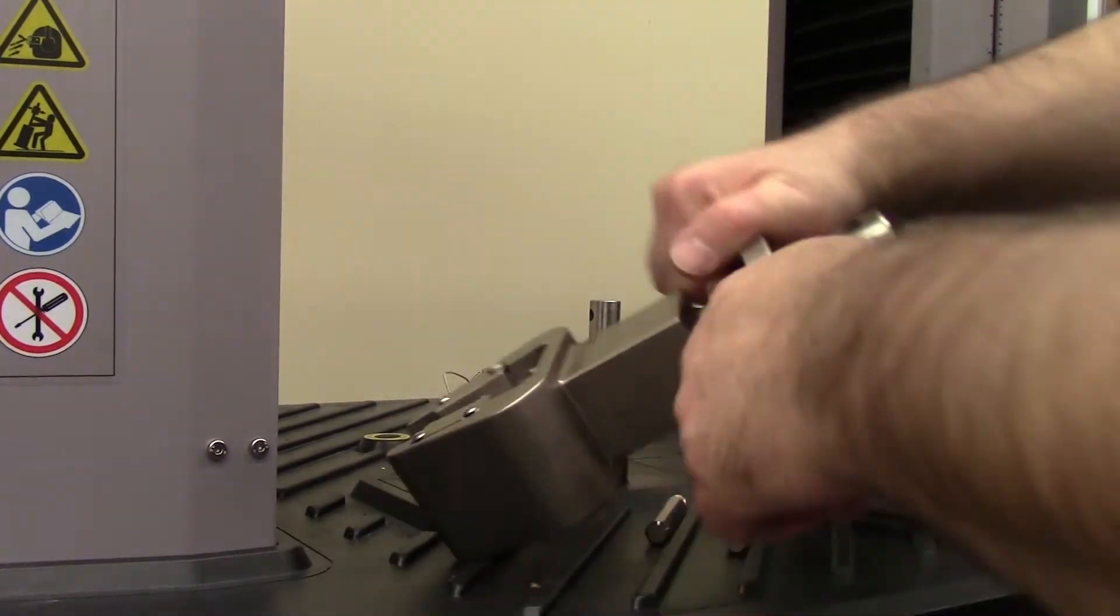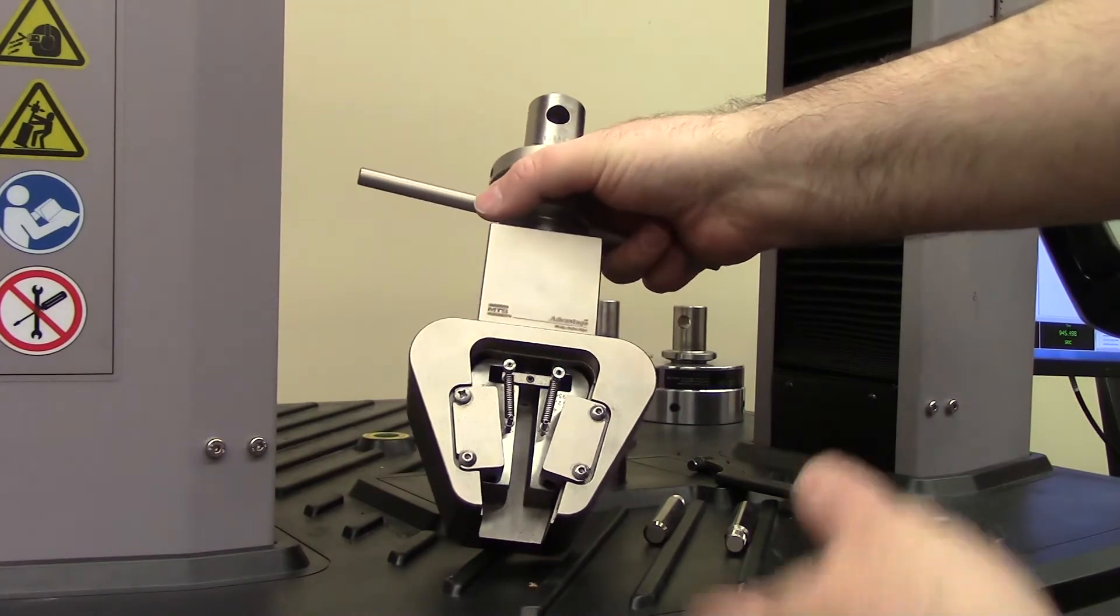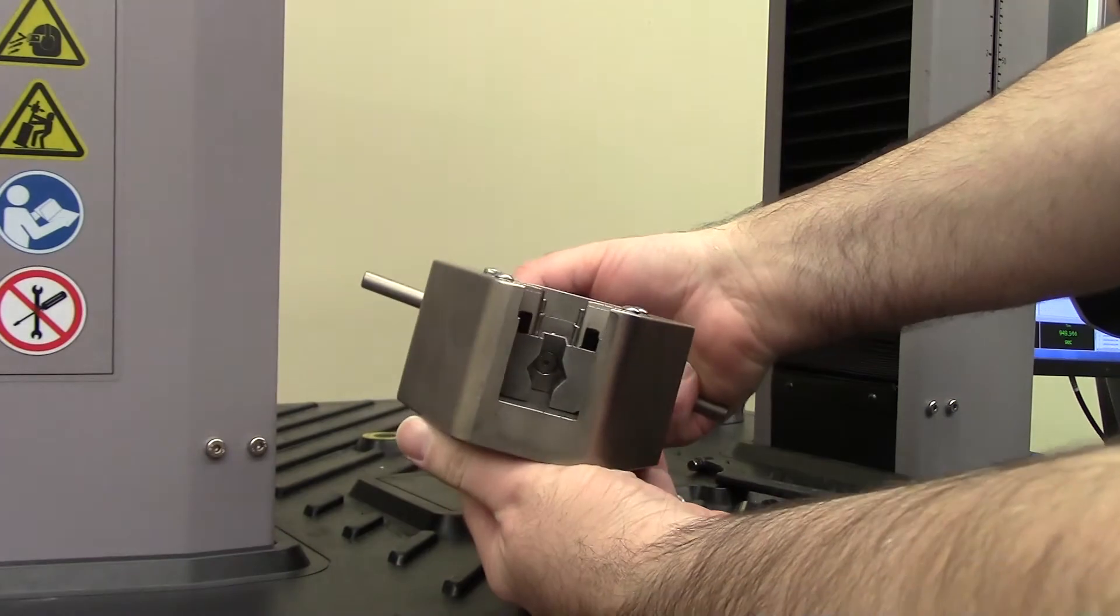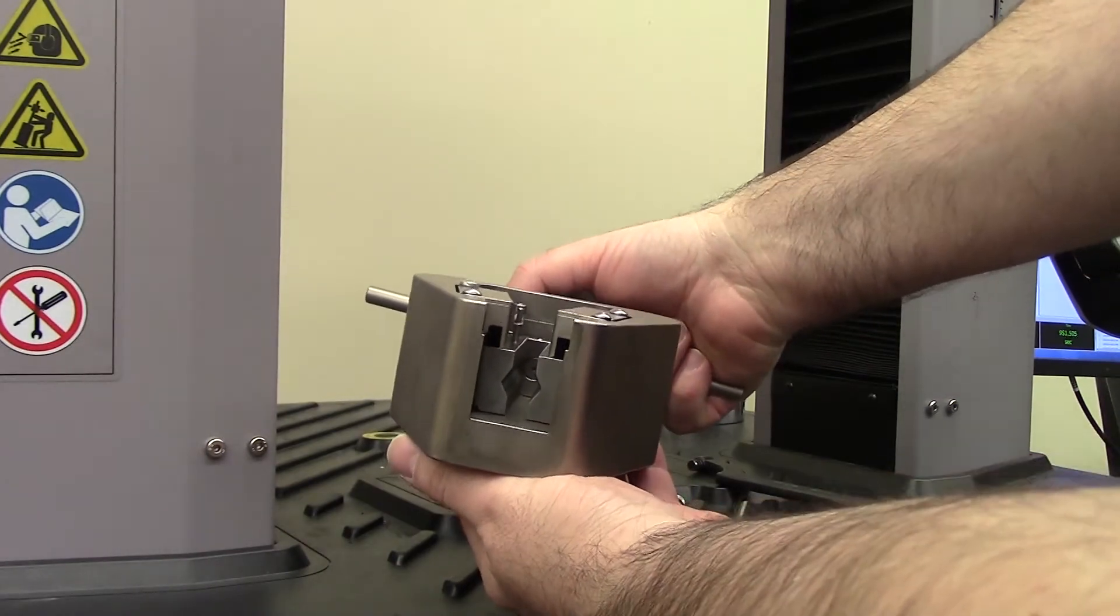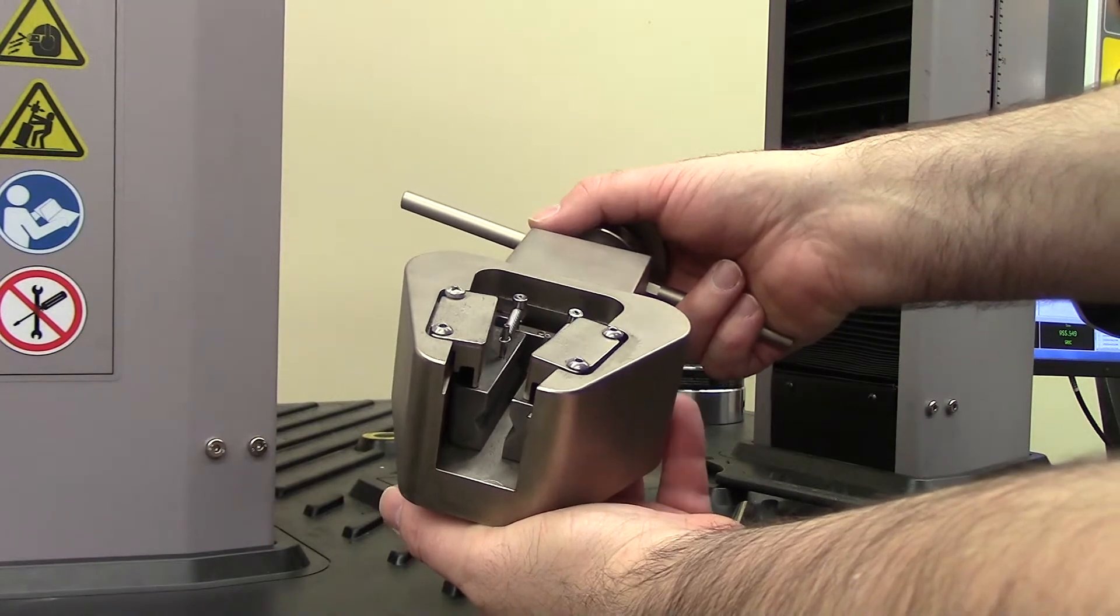We have the grips and wedges installed. This is an MTS mechanical wedge grip, and these are the inserts, the grip faces, or the wedges. They're set up now for a round specimen and there's a specification that goes up to half an inch.